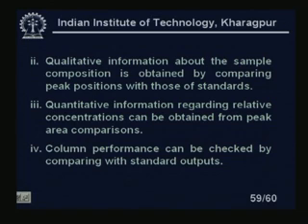Column performance can be checked by comparing with the standard outputs. Suppose I want to calibrate the column performance; I know the particular gas which we are injecting. Then when an unknown gas is coming, I can see how the column is working. So the column efficiency can also be known by looking at the chromatograph. These are the four features which we get from gas chromatography.